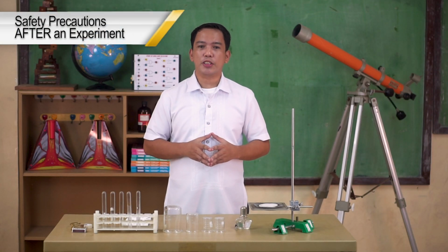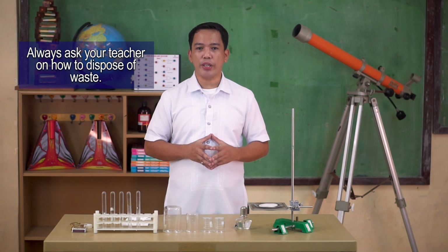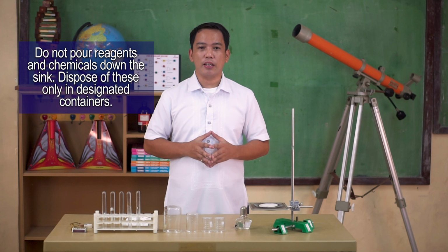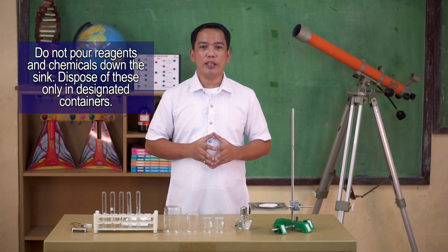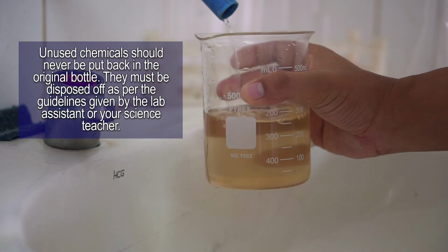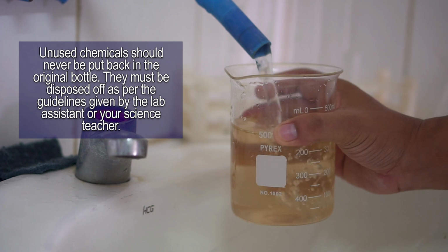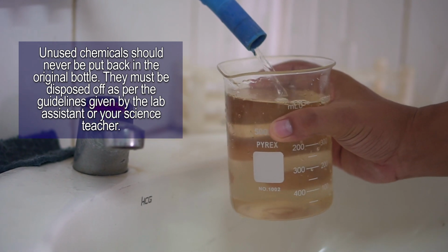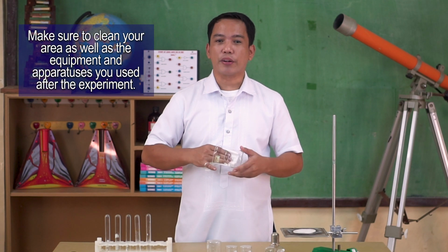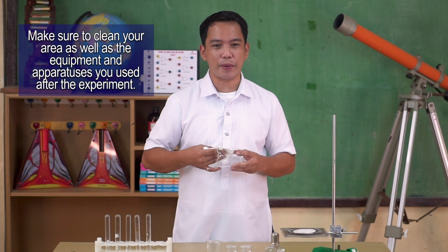After conducting an experiment, always ask your teacher on how to dispose of waste. Do not pour reagents and chemicals down the sink. Dispose of these only in designated containers. Unused chemicals should never be put back in the original bottle. They must be disposed of as per the guidelines given by the lab assistant or your science teacher. Make sure to clean your area as well as the equipment and apparatuses you use after the experiment.